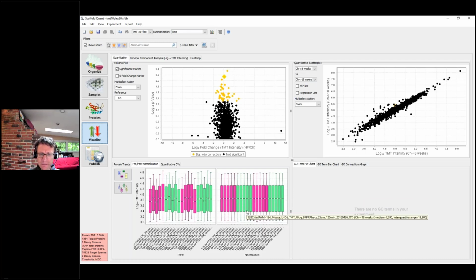showing. And just to talk a little bit about some of the other steps, one of the main other steps of normalization that is currently being used is called IRS normalization, internal reference scaling normalization. And that was a technique developed by Wellmarth and others and actually introduced with this data set. So that's kind of nice.